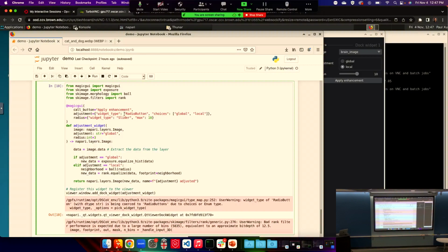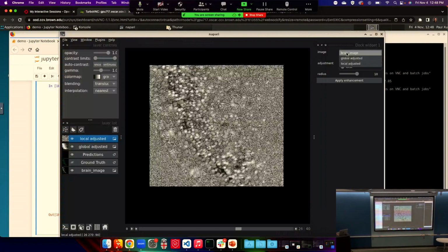And also, you can use Napari's own types in this function as well. So I just passed image as a napari.layers.Image, an image layer type, and then what Napari did is it automatically generated a dropdown that allows you to only select layers that are images.